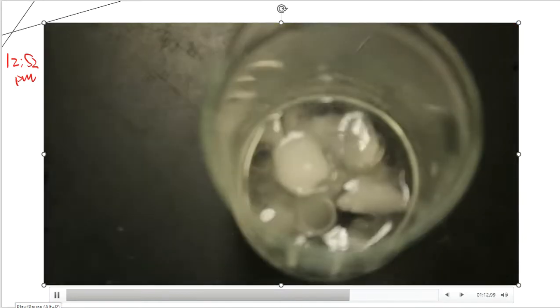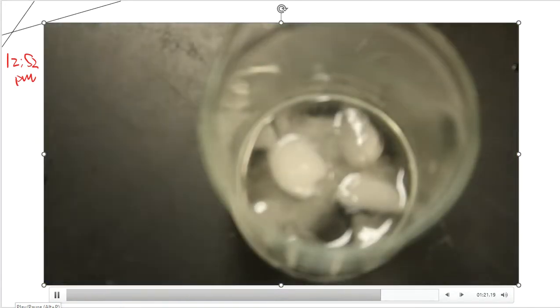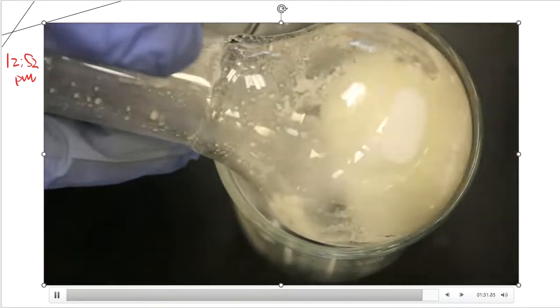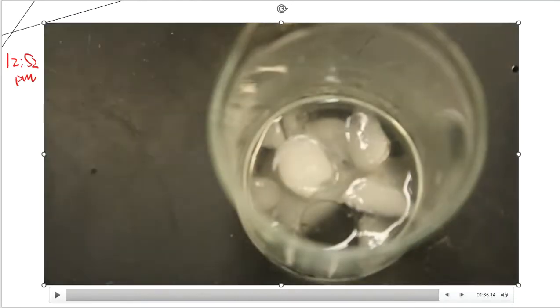So it tells me to use a little bit of methylene chloride and then get this out of the actual container and pour it over the crushed ice as well. So that's the next step, and that's what I'm going to do. I'm just going to rinse this flask out with some methylene chloride, and that way I can get all of that solid out and into that flask with the ice down below. All right.